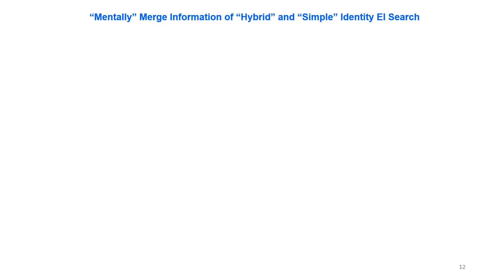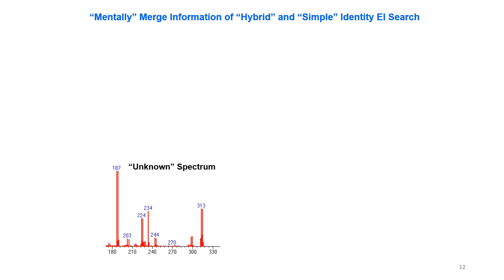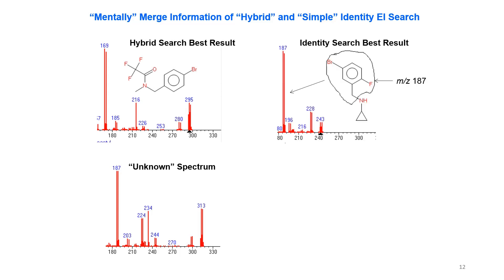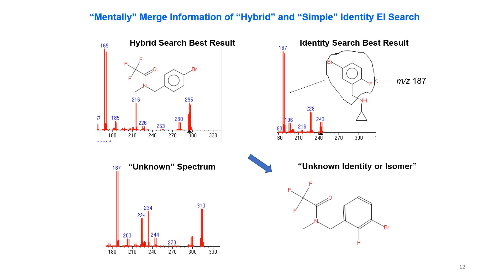Let's mentally merge the information from the hybrid and simple identity EI searches. From the hybrid search, the best result is a known compound; from the identity search results we know it has a benzyl group with a bromine and a fluorine. Putting them together yields the proposed structure for our unknown identity, though it could be an isomer. This was actually a purchased compound not yet in the current databases — it was being added by NIST — so I used it as a test case.